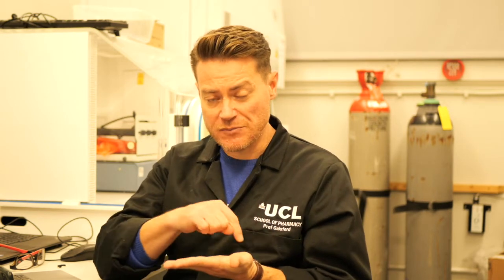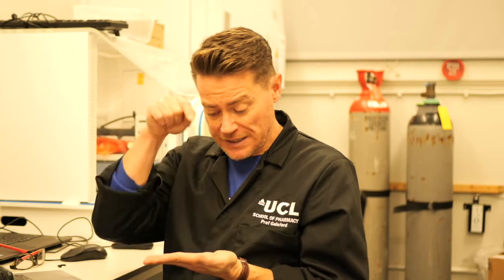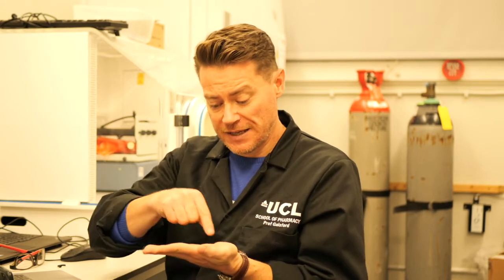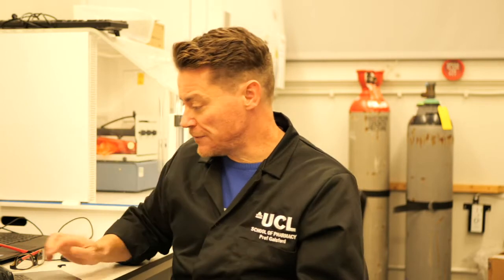That point is then moved across the surface of the sample, again by magnets, and it's done in a raster pattern. So rastering means moving backwards and forwards across the surface of the material. So think of it as a single point which is hitting the surface and reflecting off, and then we move backwards and forwards across that surface. So a bit like an old TV monitor, if you've ever seen one of those, which was done with an electron gun, and it's got lines going across it. The image is created in the same way, with lines. And quite often, if you sit at the SEM and you watch the image appearing on the screen, you'll actually see it appearing as a series of lines, because that's the way the image is actually being created. So rastering across the surface of the material.